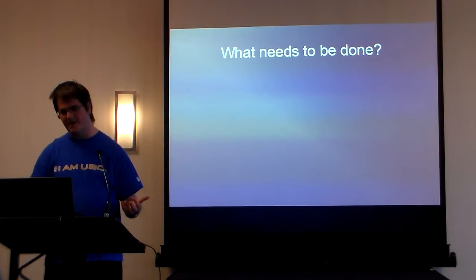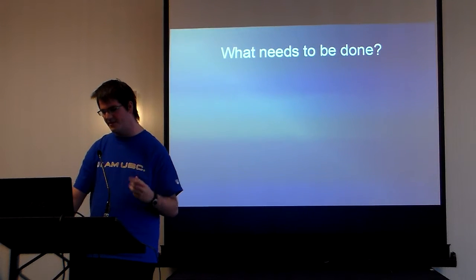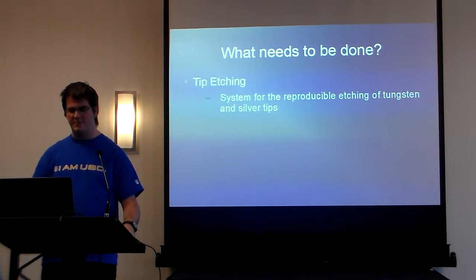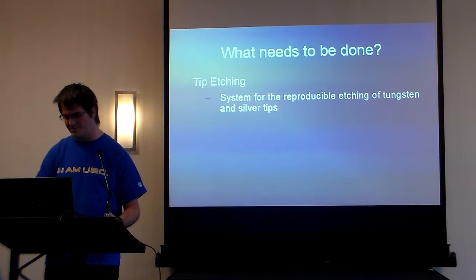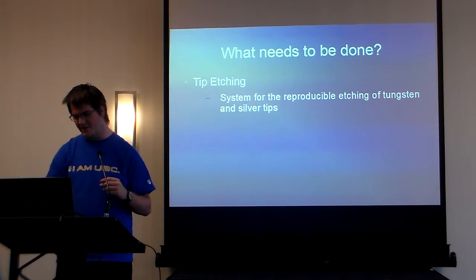And so in order to have STM luminescence experiments, there's three really important things that I did. There's the tip etching, which needs to be reproducible for these tips. They need to be incredibly sharp for this technique to work. And we did tungsten and silver for reasons I'll explain in just a second.